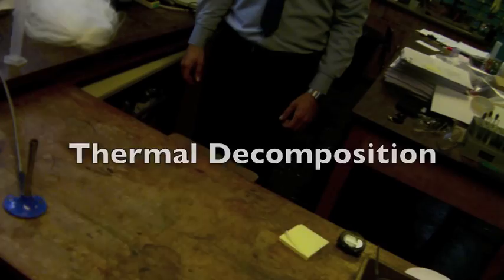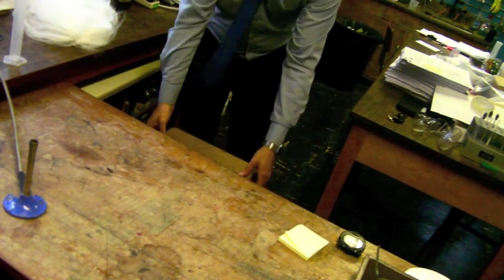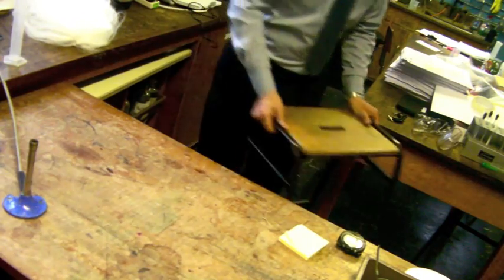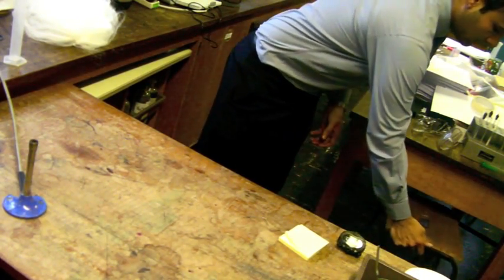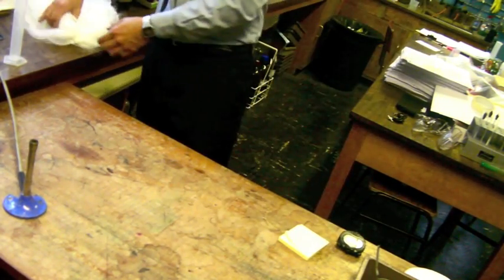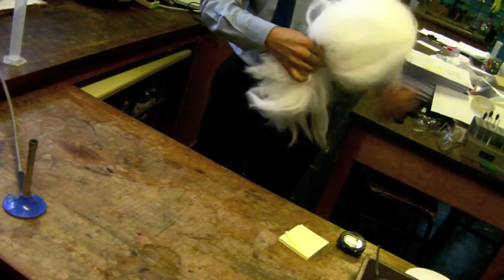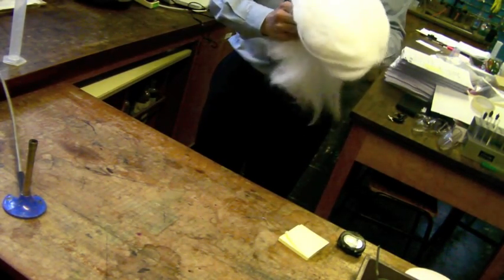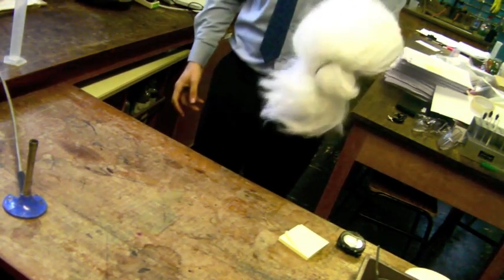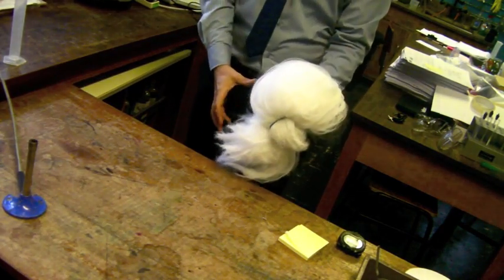Welcome to the Chemistry 1 GCSE Science Controlled Assessment with Mr Dos Santos. Ensure all the stools are tucked under the table and out of the way. We will be working with Bunsen burners, so if you have long hair, make sure that it is tied up safely. Very well done Mr Dos Santos.